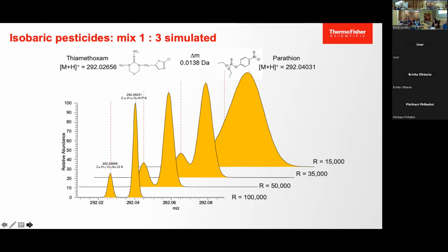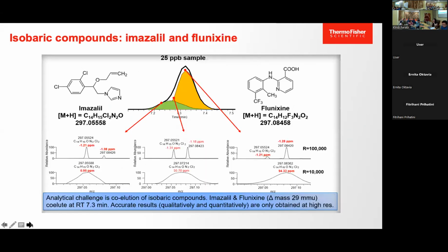And you are able to get clear identification and quantitative structure. Because eventually on a later slide, you will notice that the accurate mass will help you derive the chemical formula.